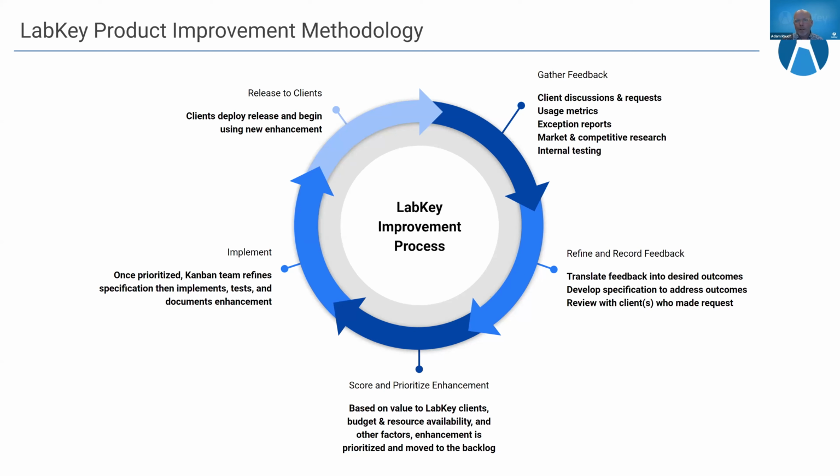So they will typically refine the specification, implement the code, test the code manually, write integration tests and automated tests, and document the enhancement. That then goes into the next release, and clients deploy that release, they start using this enhancement, and the process starts all over again.